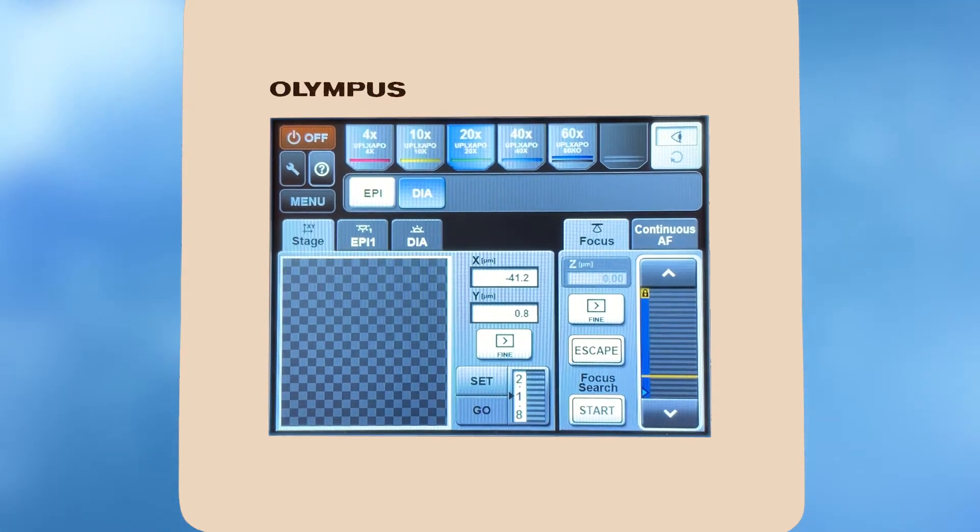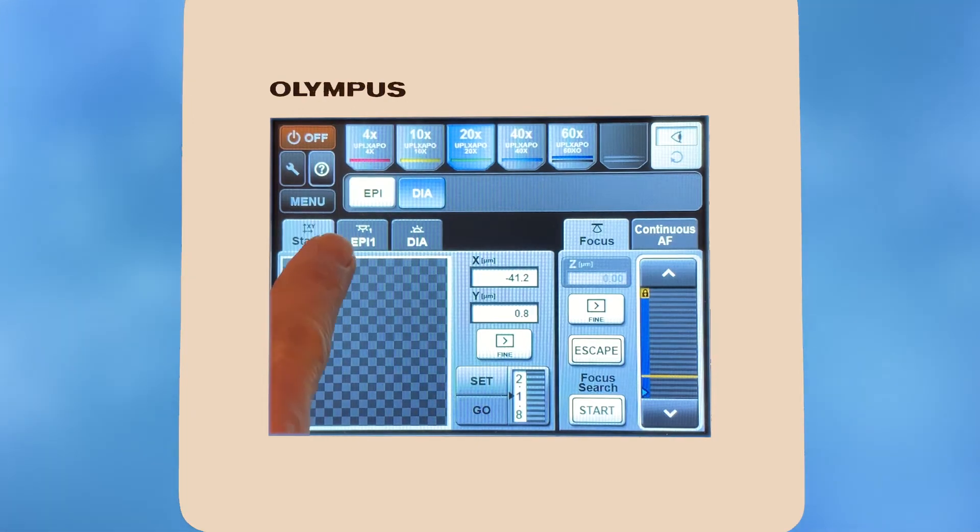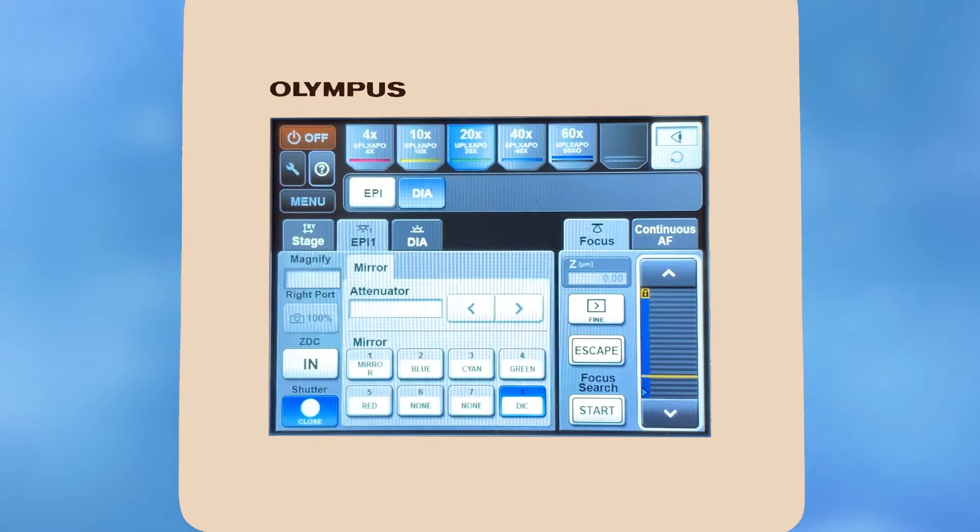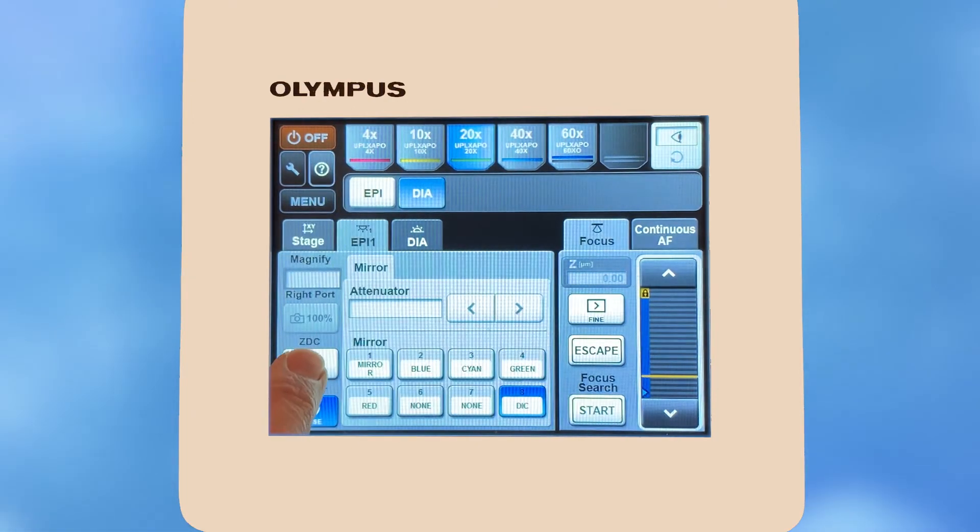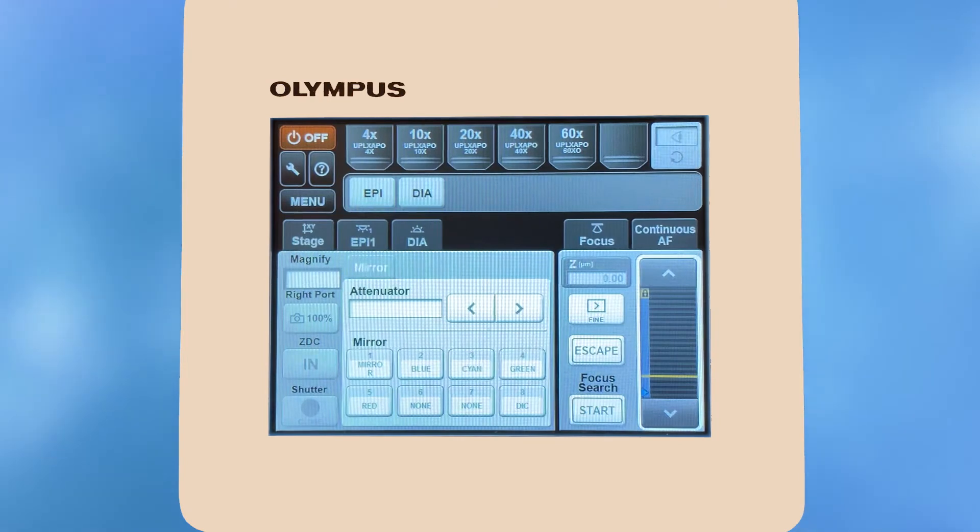To enable the true focus Z-drift compensation, select the epi-1 tab and press the ZDC in button. It turns blue when the ZDC is enabled.